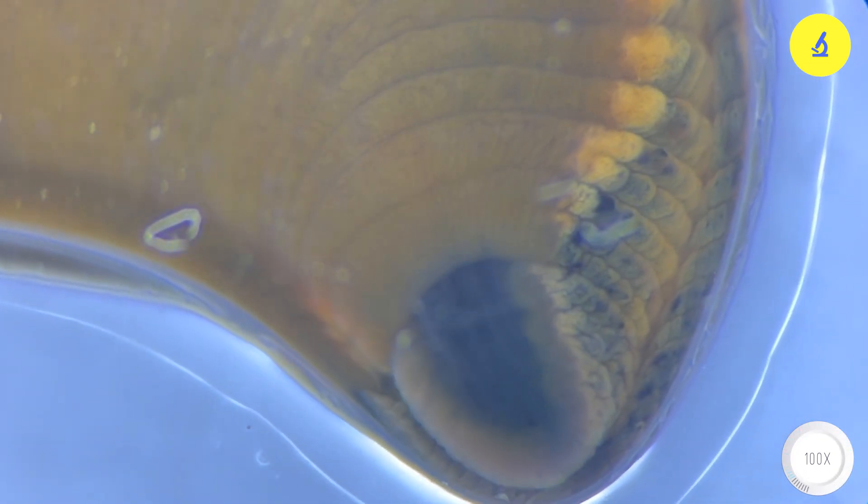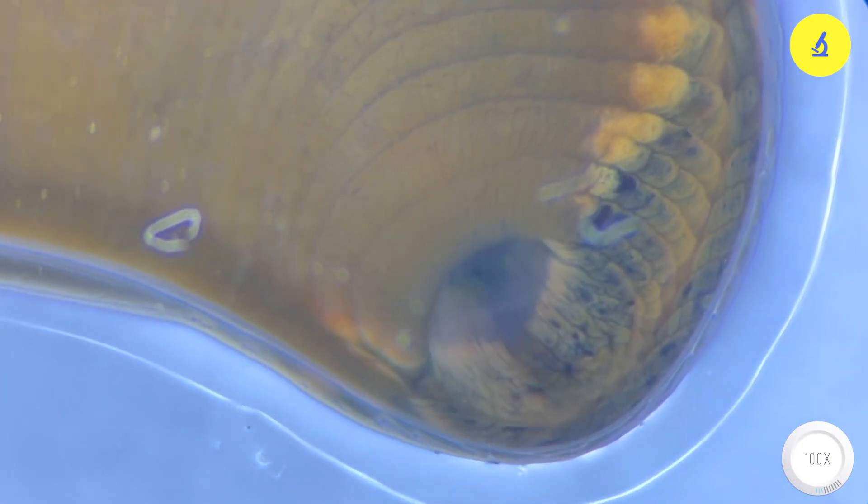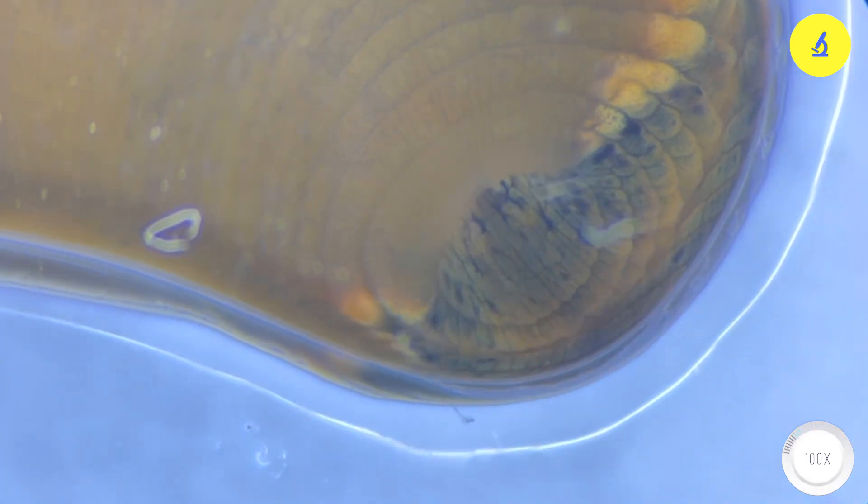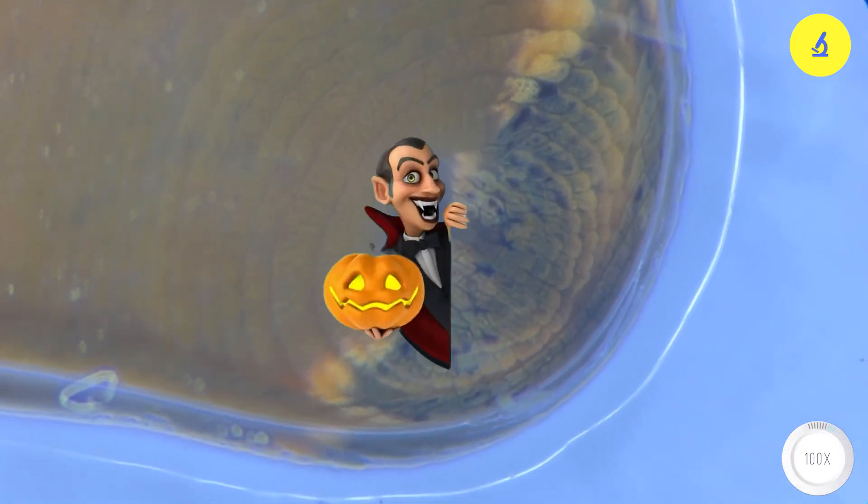This is the sucker on the rear body, which is like a hook to move the front body like a measuring worm. The sucker on the head, however, is terrifying because it contains a secret weapon, which is a suction cup with three jaws, each with 90 teeth, making a total of about 270 teeth. The leech will use the suction cup to bite the prey and firmly attach to suck blood, clinging so tightly that it is difficult to remove it from the host by hand. After biting, it leaves a bite mark on the host's skin that looks like a long letter Y. It's no different from vampires.